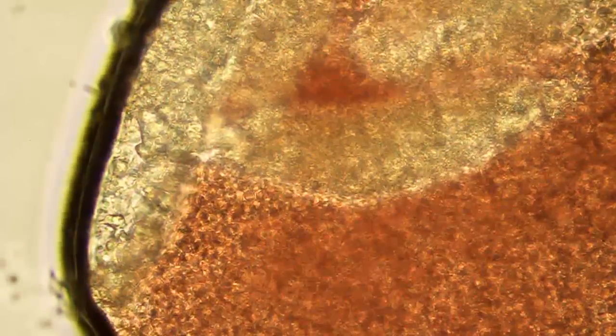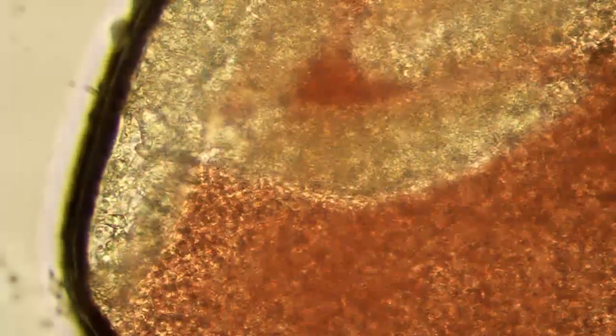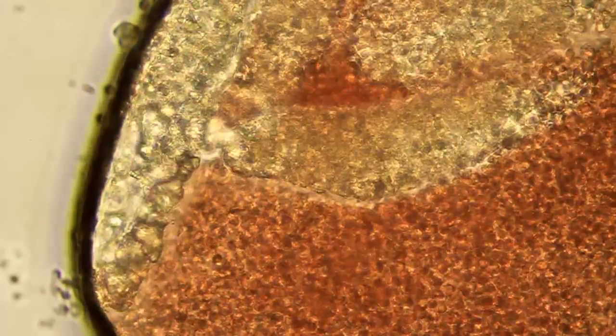Probably that light colored stuff is a mass of white blood cells. Maybe. I don't know. I'm not a scientist.